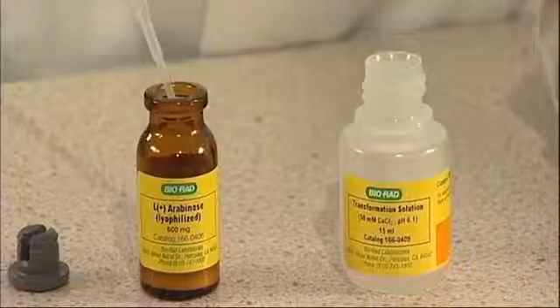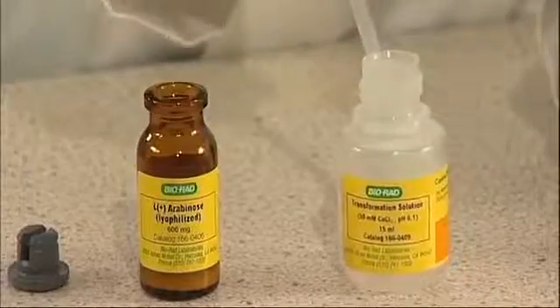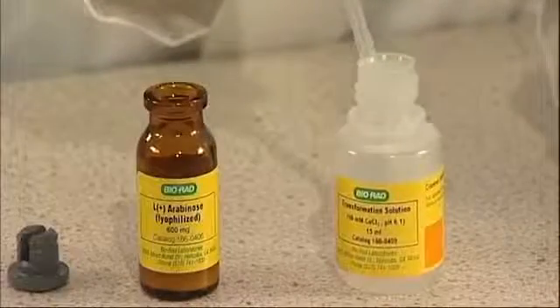With a fresh transfer pipette, rehydrate the arabinose in 3 ml of transformation solution. This will take about 10 minutes to dissolve. You can speed up the process by warming the bottle at 37 Celsius.